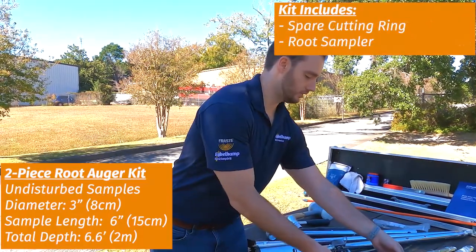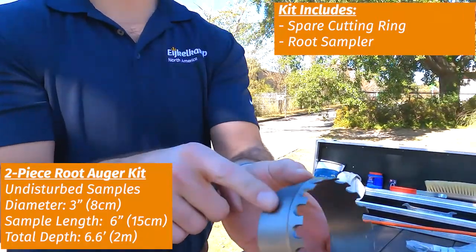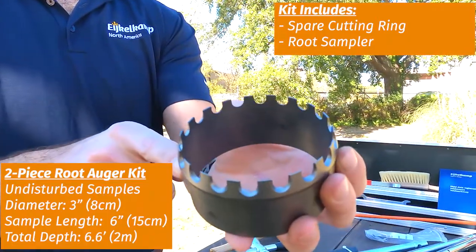And then that's where you'll switch to something that actually has the cutting ring. This set comes with a spare cutting ring. You can see these teeth here — they are designed to cut through those roots to get your sample.